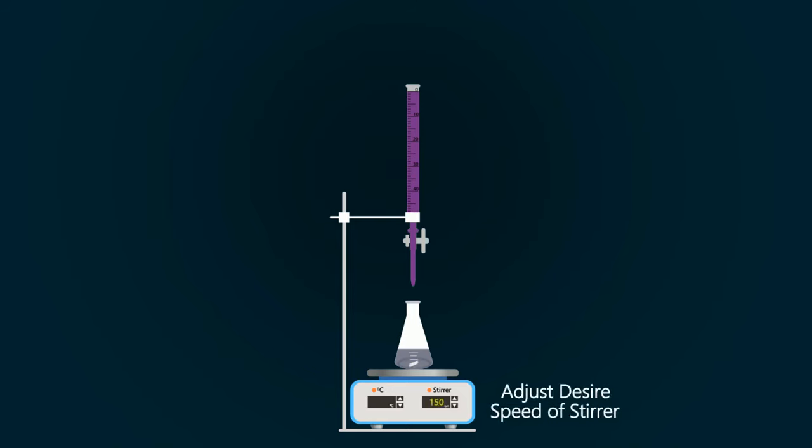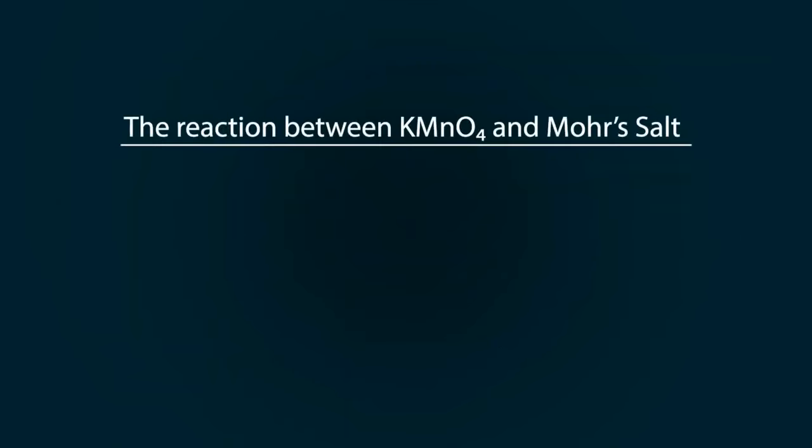Now start adding the KMnO4 solution dropwise. You can stop the burette when light pink color is achieved. Stop pouring and take the reading. The volume of KMnO4 used is 4 milliliters.